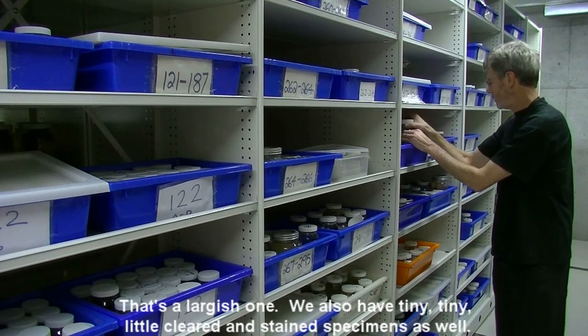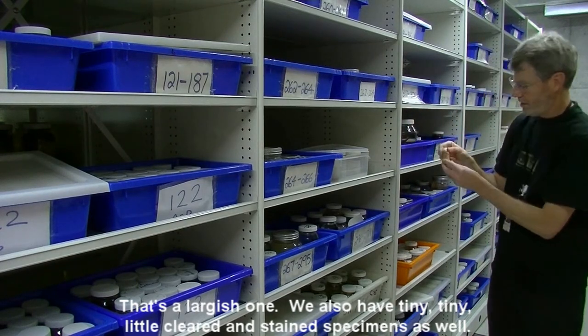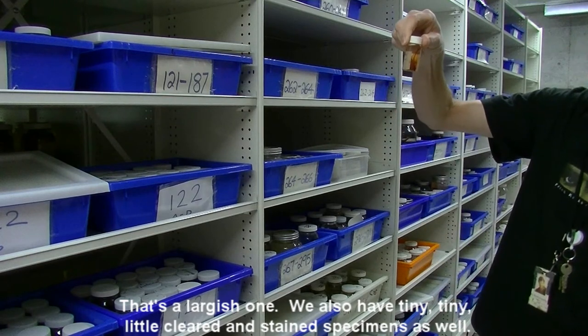That's a larger one. But we also have tiny, tiny little Cleared and Stained specimens as well.